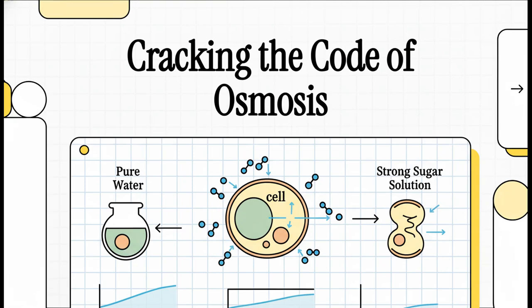All right, getting ready for your GCSE biology exams? You've come to the exact right place. Today, we're going to crack the code on one of those key required practicals, the osmosis investigation. This is a big one from section 8.2.3 of the spec, so let's dive right in.